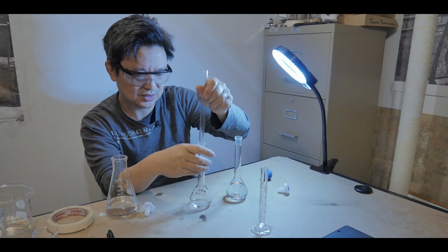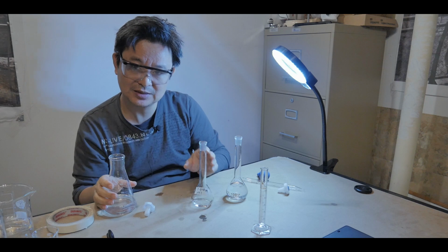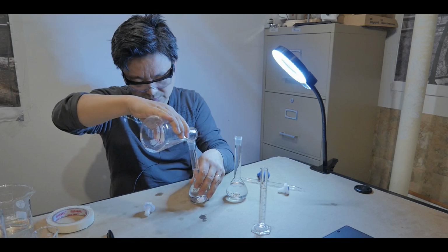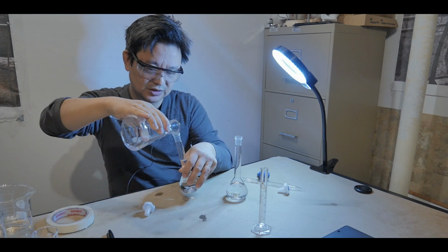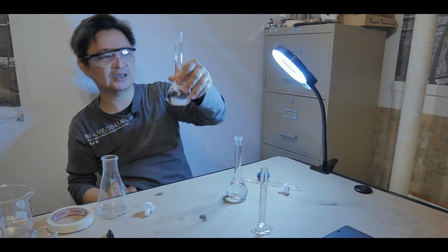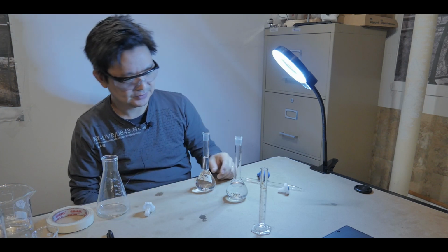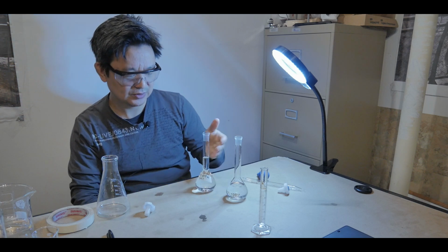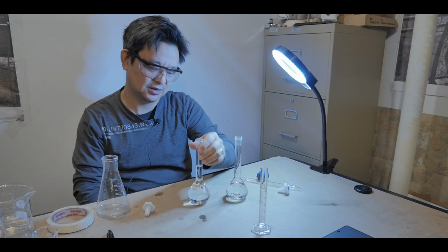Okay. So get as much out as possible. Okay. And then we pour the rest with 90 mils of distilled water. A little bit more. Just make sure you don't go overboard here. Has to be exactly on the line. No, oh, there we go. Perfect. Okay, got it. So we got 90 mils of distilled water in this volumetric flask. I put in the 0.1 molar concentration with the 90 mils. Now this is 0.01 molar concentration of hydrochloric acid.